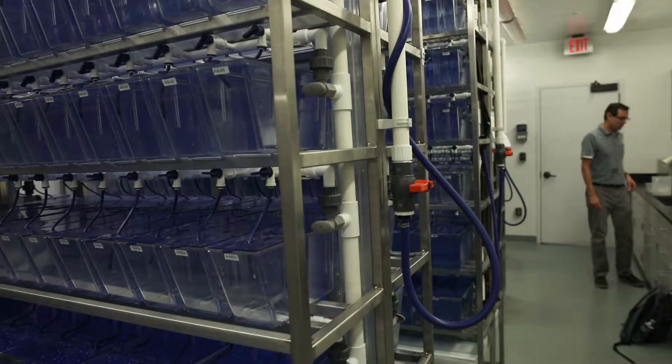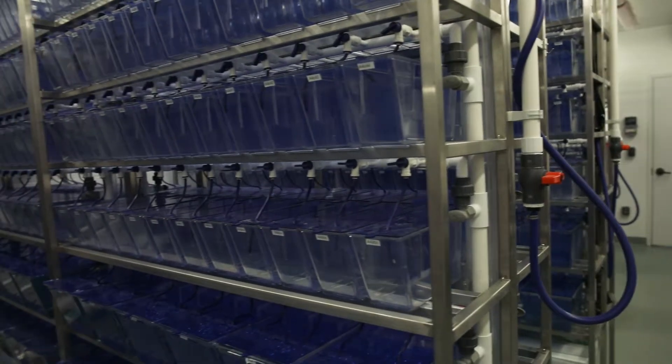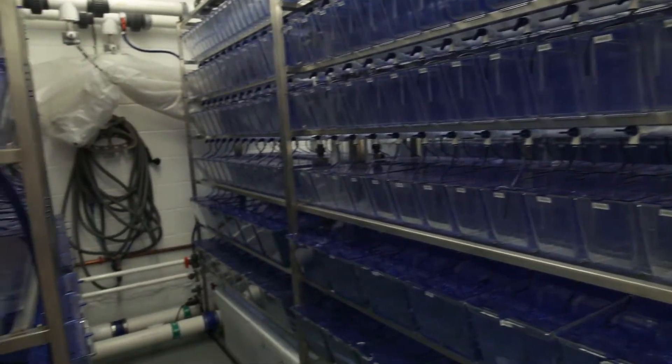Hi everyone, my name is Ricardo Cepeda and I'm the manager of this facility. The University of Miami Zebrafish Facility was built in 2010 by Aquatic Habitat.